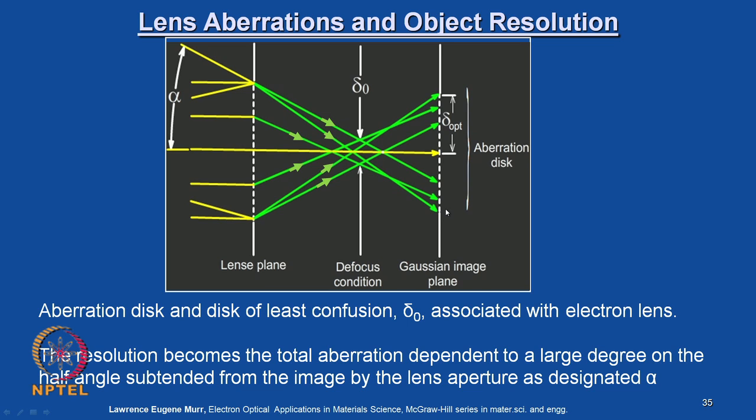So the point you have to remember here is that this is a general schematic. Whatever aberration we talk about, whether it is a simple astigmatism, chromatic or spherical aberration, all these aberrations direct this light ray or electron beam into a different focal point, whether on axis or off axis, as we have seen. So if you think of all the aberrations which impair the resolution of the optical system or electromagnetic lens system, it is the total combination of all these aberrations put together.